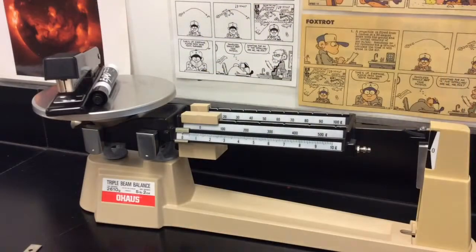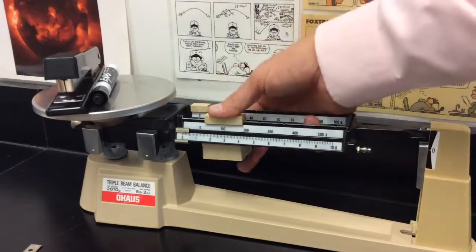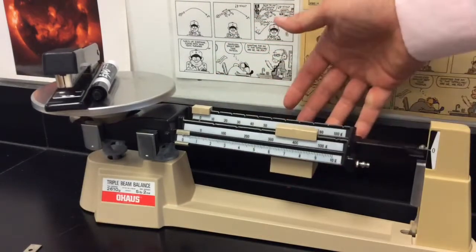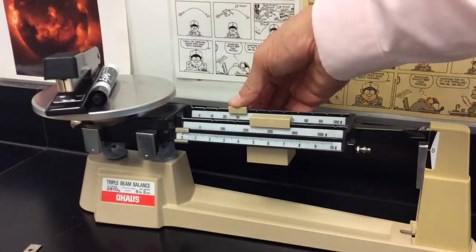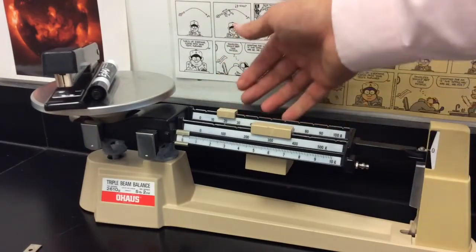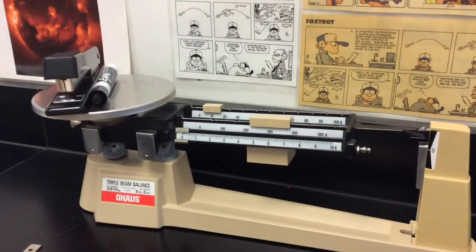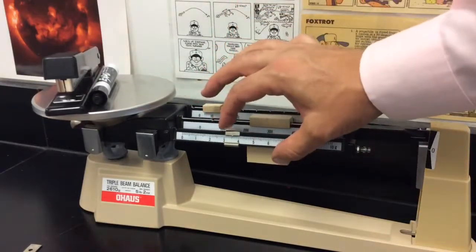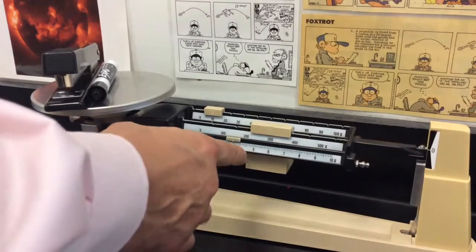This is how I was taught to measure with a balance. First you start with the biggest one — slide it across slot to slot until it tips, then move it back one. Same thing with the 10 gram: slide it across until it tips and move it back until it doesn't. Then use the smallest one to balance it out. Slide it over until it's about right and tick it back and forth until you get it properly balanced.